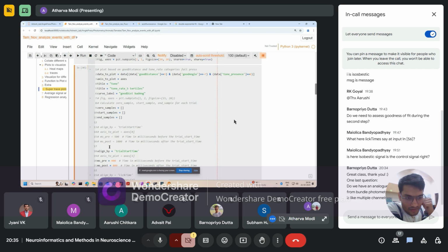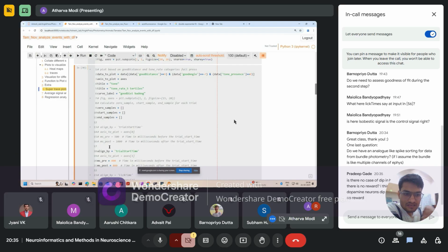I think so. I have not read extensively on that. I had initial plans to do that, but what we get is you can put a camera and image the bundle basically using the camera. So you get pixels, each bundle has some pixels. You may get correlations between bundles of fibers, but how do you deal with that, I don't know. I'm not really sure.